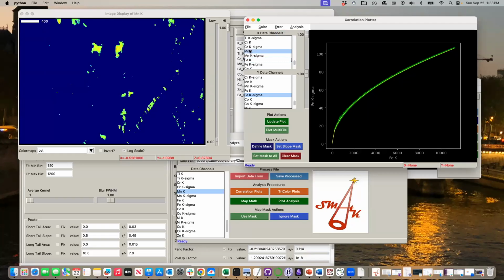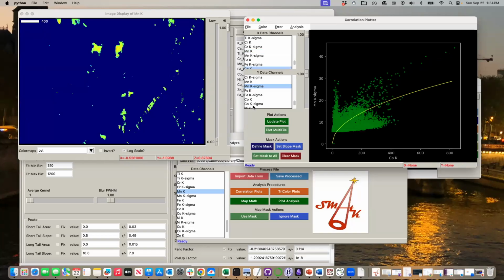Can I trust manganese data? I can up to a point here, but there's these little bits here. There's a little bit more error, right? So the manganese that's in that chromite grain has higher error than I might expect. And that's okay too. This tells you where you might not be able to fully trust all your data here. How about the cobalt? Do I trust cobalt data?